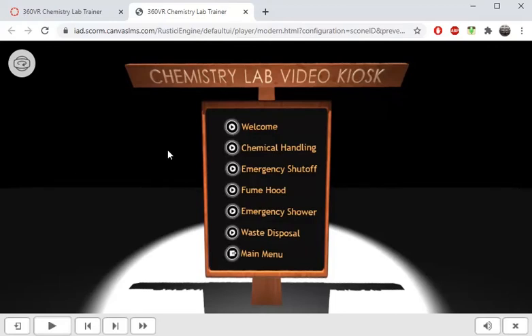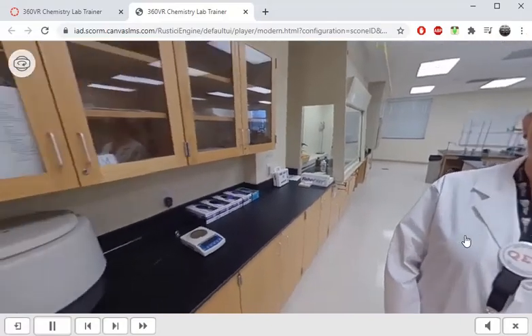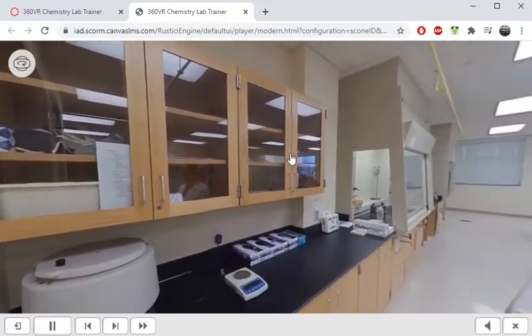Let's begin by taking a look at one of these training videos now. Here the instructor is giving us a welcome to the course. She is showing us the basics of personal protective equipment, and what some of the expectations are for us while we're in the lab. It's interesting being in a 360 environment because we do have the ability to look around and see what she's maybe speaking about that isn't right in front of us. This is a big advantage of 360 video. Let's go back to our main menu.